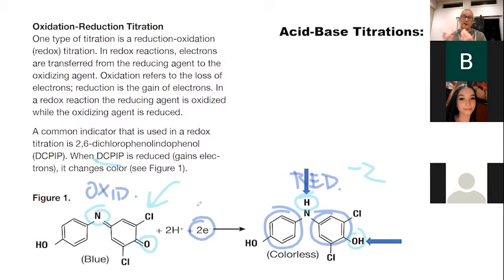And so we'll know when all of the vitamin C has been oxidized when we start seeing the blue color reappear, because it should be clear as it's being reduced, reduced, reduced. Then when there's no more vitamin C to be oxidized, then it'll turn blue. Then we'll see a small bit of blue again, because basically it means we're adding the blue version and there's no more vitamin C for it to go back to being the reduced.